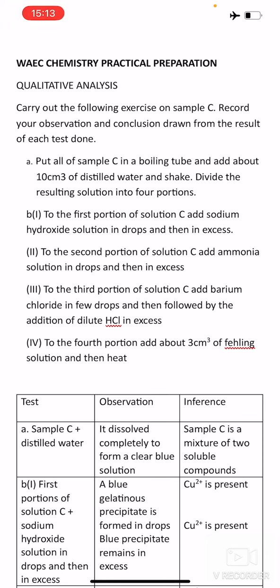And today I will be talking about qualitative analysis. That's the second section which we are going to be doing on Tuesday. So that's on qualitative analysis. And qualitative analysis just involves the identification of compounds, either anions or cations, and organic substances too.